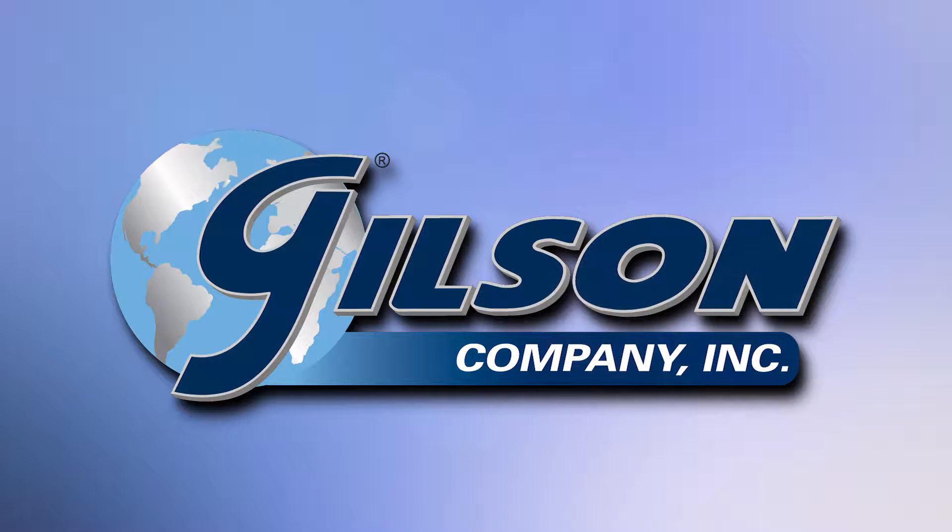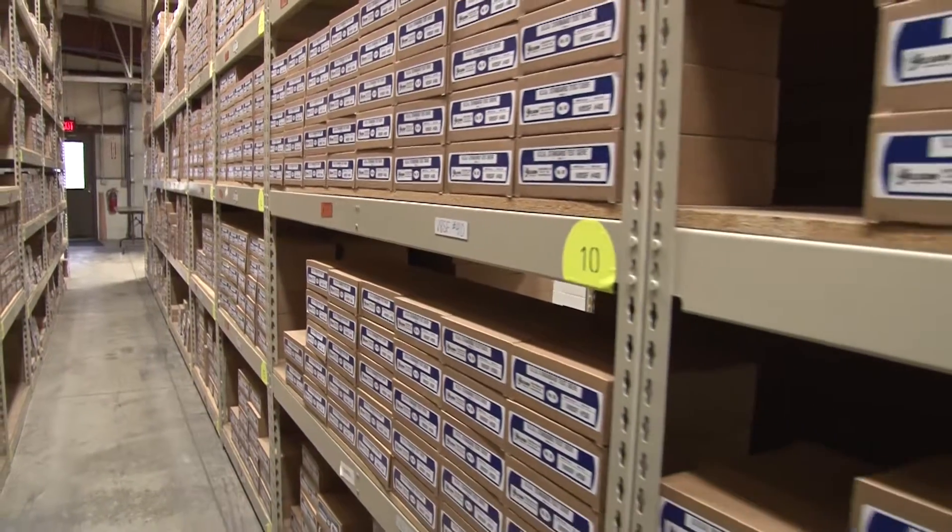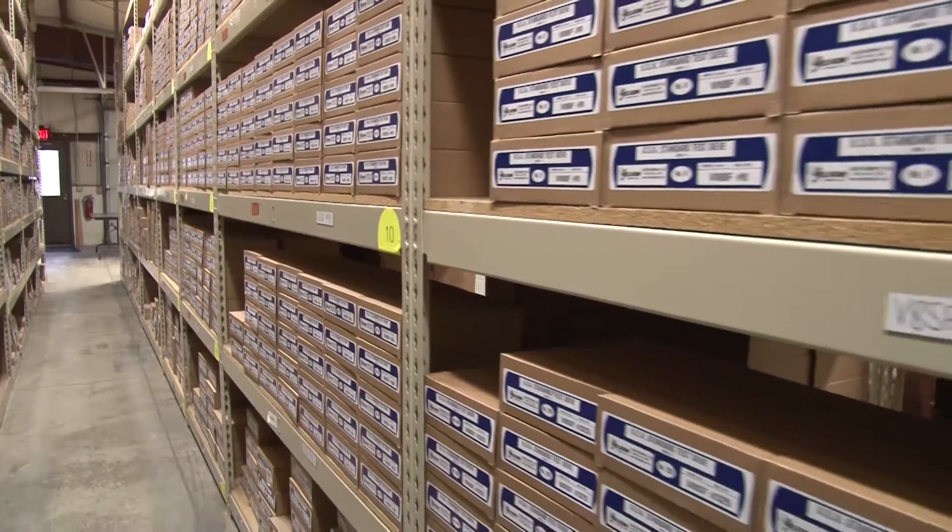When you need testing sieves, regardless of size or type, Gilson is your best source. Gilson stocks the widest selection and the largest quantity of sieves than any other material testing supplier.